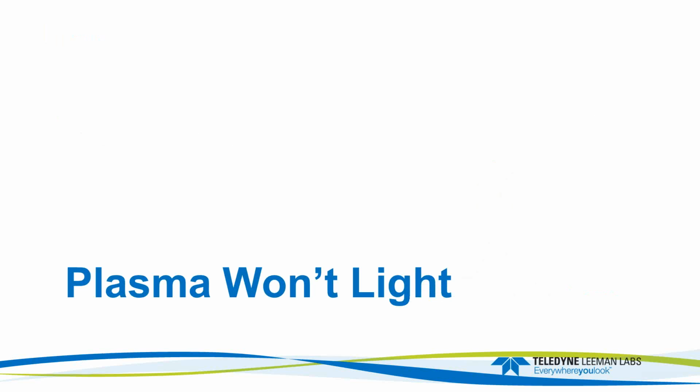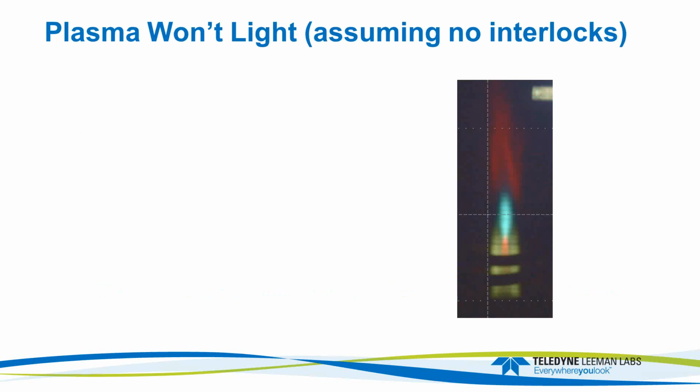We all sort of suffer through that occasionally. So plasma won't light. And again, this is assuming you have no interlock. So if you have an interlock, you've got to address that: RF power, current, or whatever the interlock has to be. The water's not turned on. So this is assuming you don't have any interlocks. Sample introduction leaks, you have air getting in there. So you've got O-rings that are hard, or you've run organic solvents and they're starting to crack, and you get some air in there.